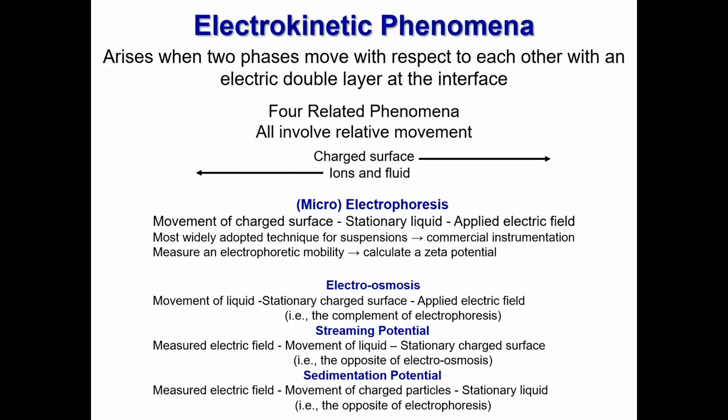From microelectrophoresis, you obtain a parameter called the electrophoretic mobility, from which the Zeta potential is calculated using some appropriate theoretical model. I'm not going into any further details of the different electrophoretic models, or the techniques, or the various models used for the calculation.